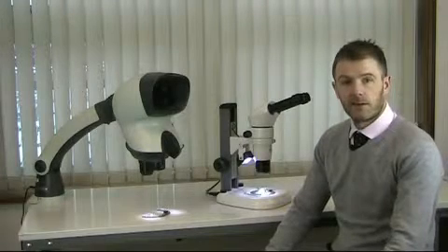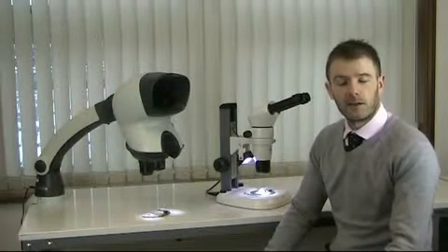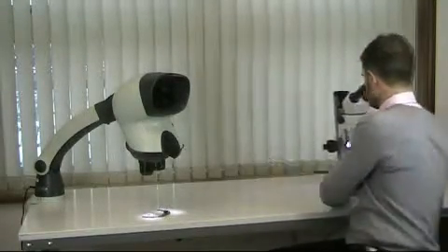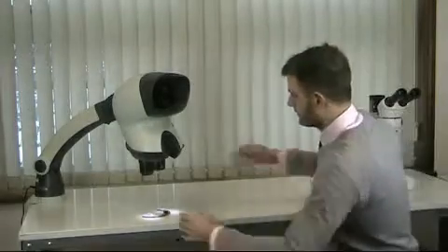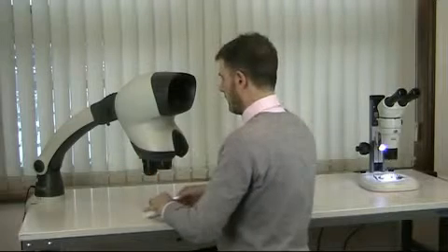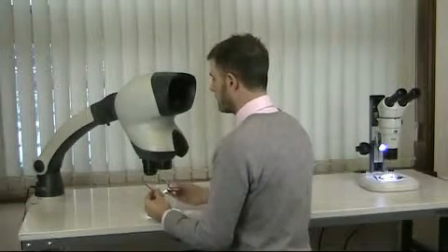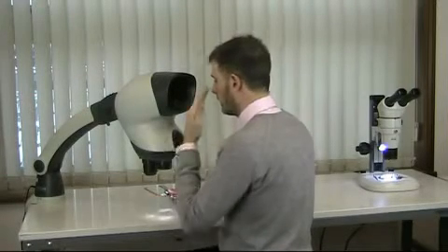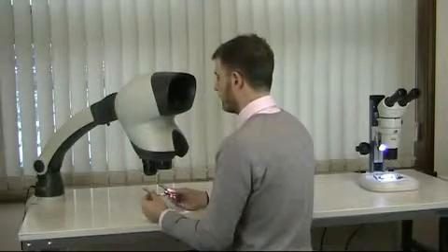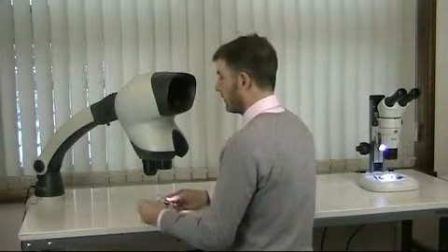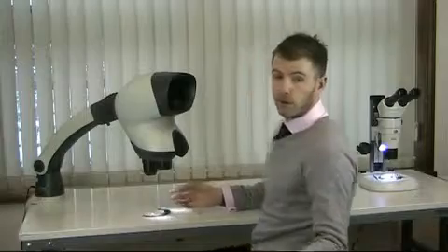With Mantis, our patented technology means that you don't need the conventional eyepieces of a stereo microscope. So there's no need to precisely align your eyes. Wherever I move, I can still see the image. And the eye relief that this affords me means that I can wear prescription glasses or safety goggles if required.